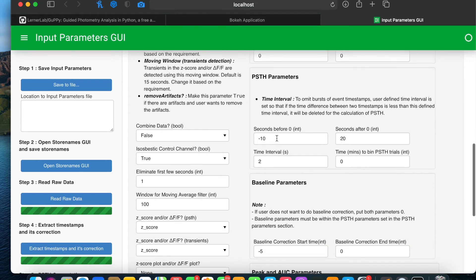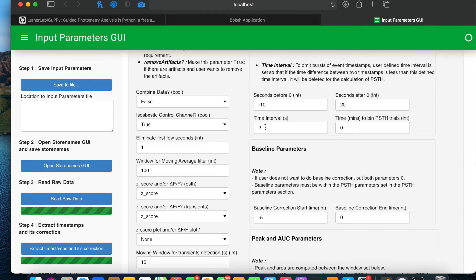For PSTH parameters, the PSTH is made such that the event occurs at 0 seconds, with the trial taken from minus 10 seconds before 0 to 20 seconds after 0. To omit bursts of event timestamps, users can define a time interval so that if the time difference between two timestamps is less than this defined interval, only the first timestamp is considered. For example, if two timestamps occur within less than two seconds of each other, the first is used in the analysis and the second is omitted.